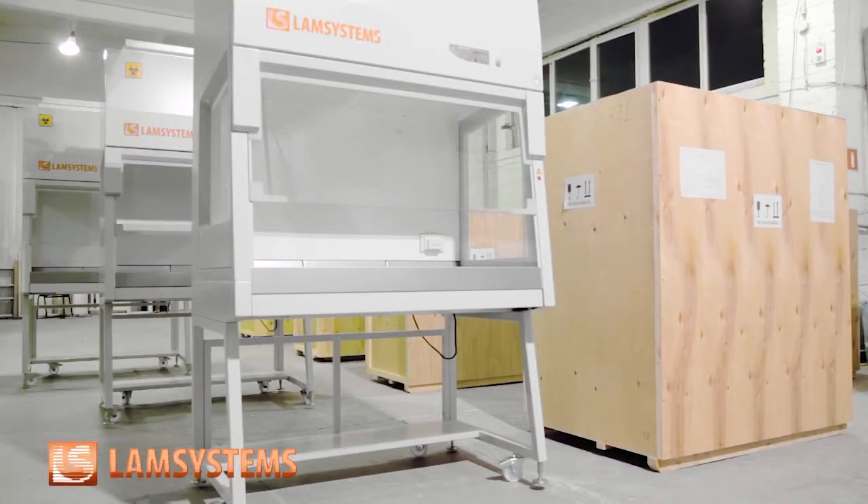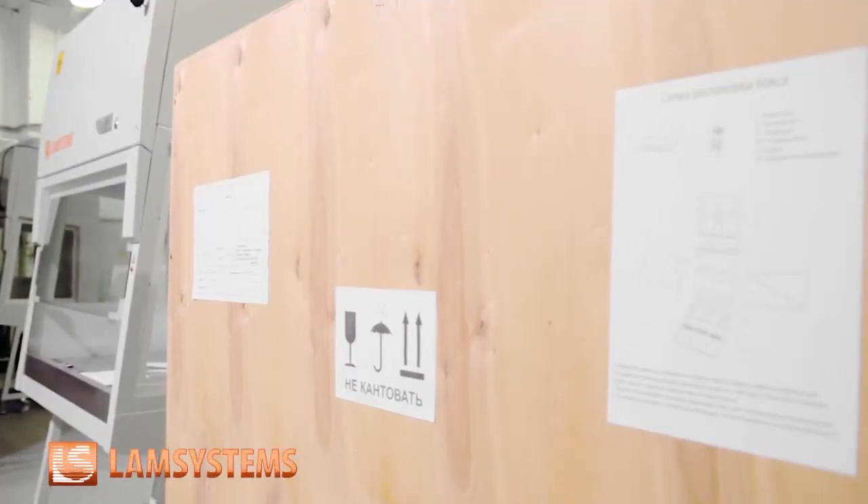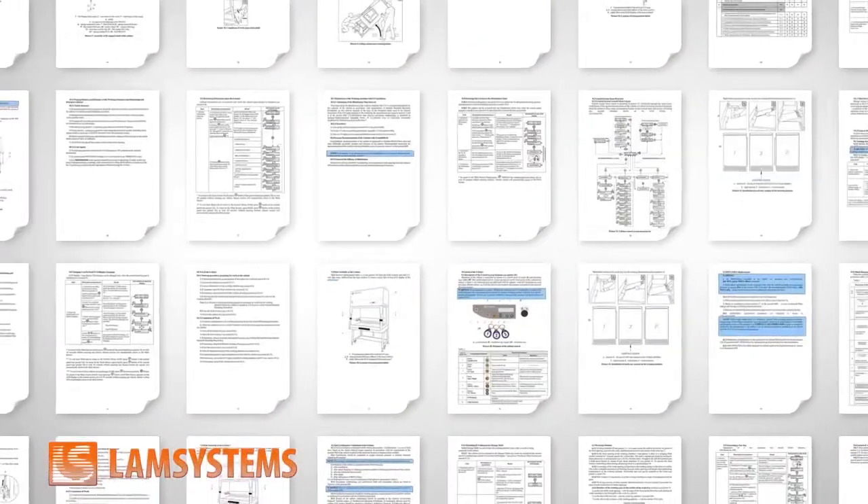The cabinet is delivered to customers in a wheeled case protecting the equipment from damage during transportation. Every cabinet has a detailed user manual where you can find information about the cabinet configuration and technical characteristics.